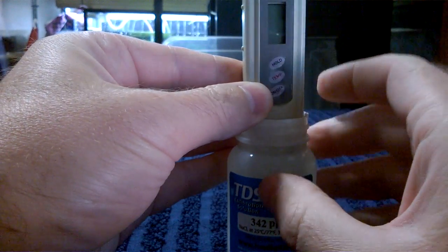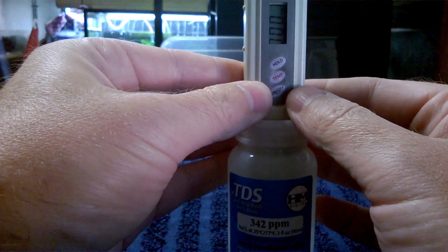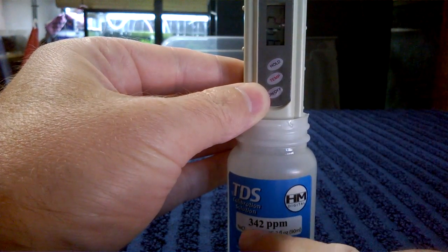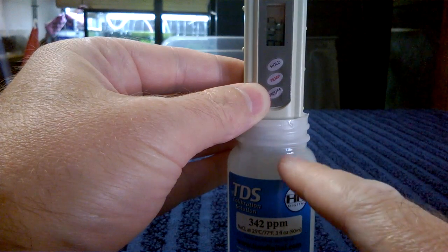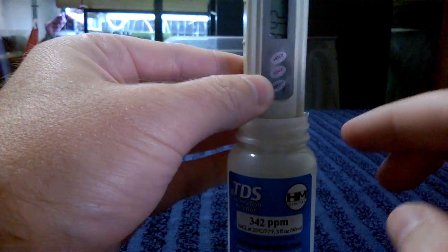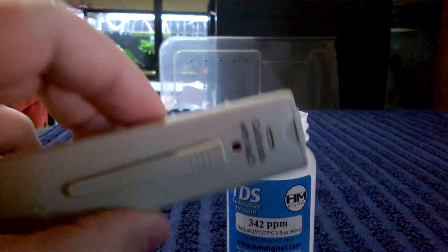Switch it on. This one says 342 — you can see that clearly, 342. There is 342 parts per million of salt concentration in this calibration solution, and this TDS meter reads exactly that, so this TDS meter is calibrated.